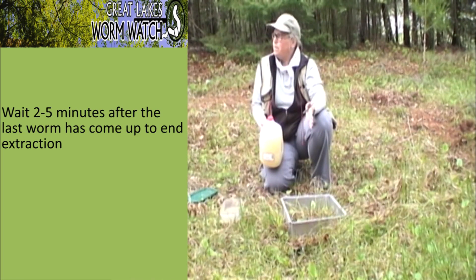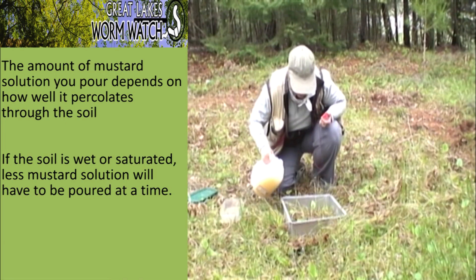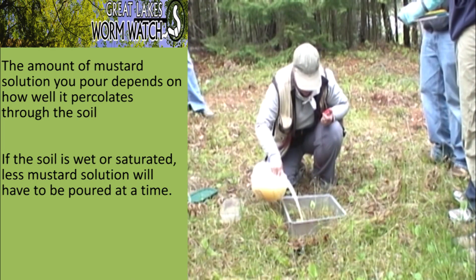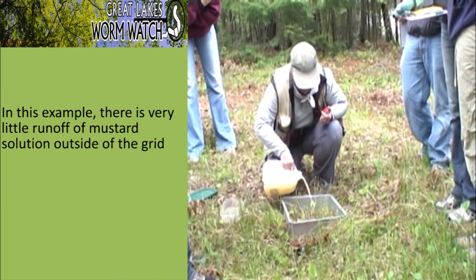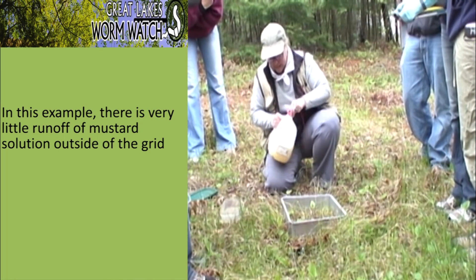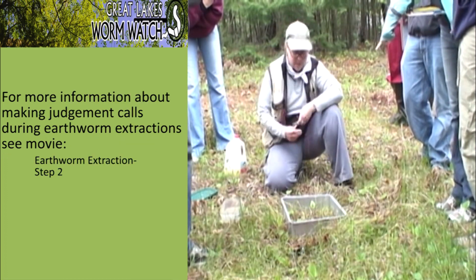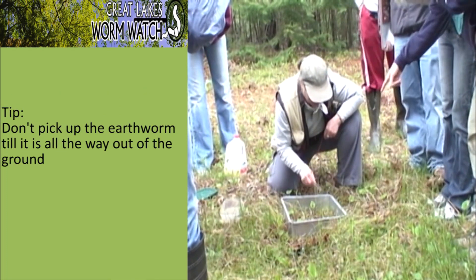Okay, here we go. You can move in a little closer if you want to see the worms starting to come up. This is percolating in really well — I'm getting very little runoff, which is good. That means if I do get an earthworm coming up laterally, it's highly likely that it encountered the mustard here. If it comes up over here, I'm going to take it because I didn't get any runoff over there.